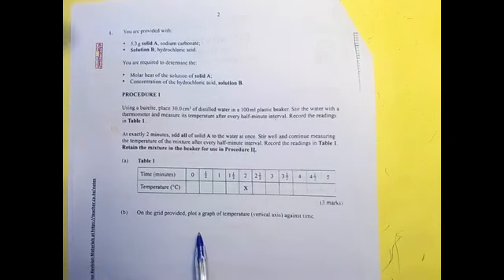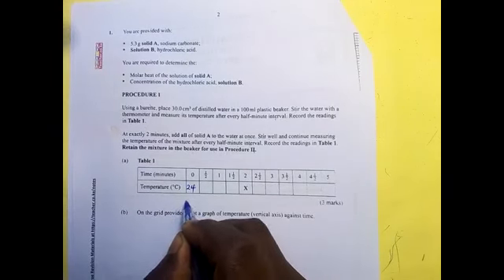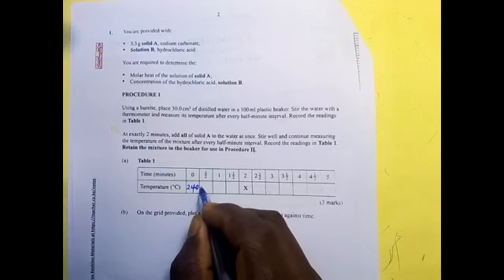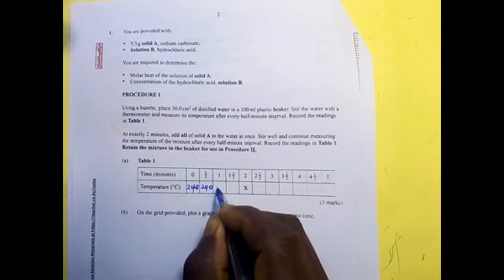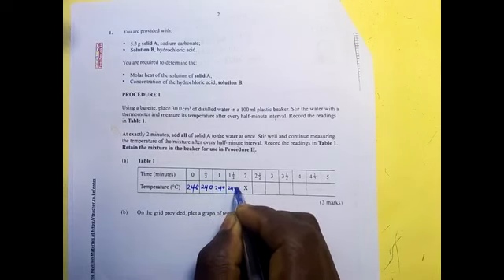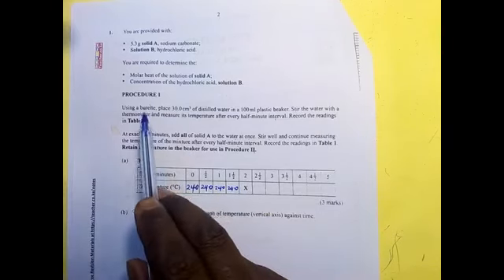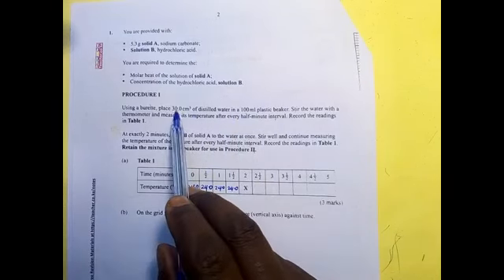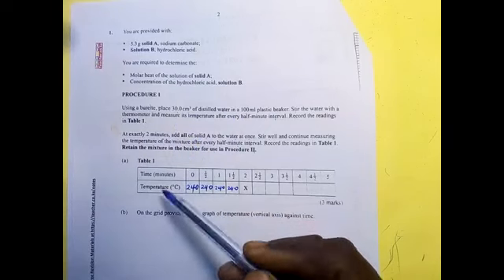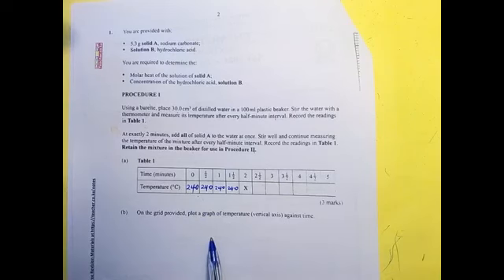So, we want to use these values. Let us use 24. You can put 0.0 to 1 decimal place. 24.0, 24.0, 24.0. The reason why I'm putting 24 is that you are measuring the temperature of this water at room temperature before you have added anything. So the room temperature could be 24, 23, depending on the weather that day.